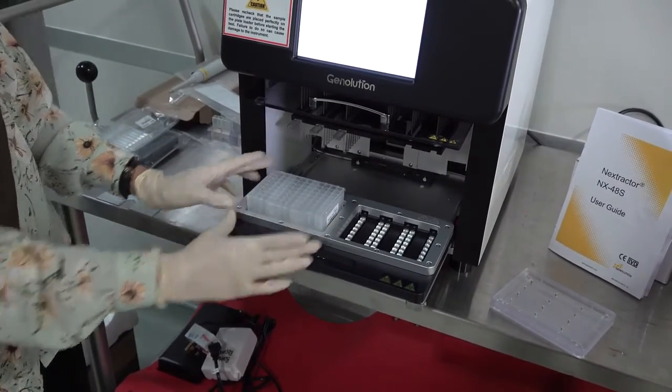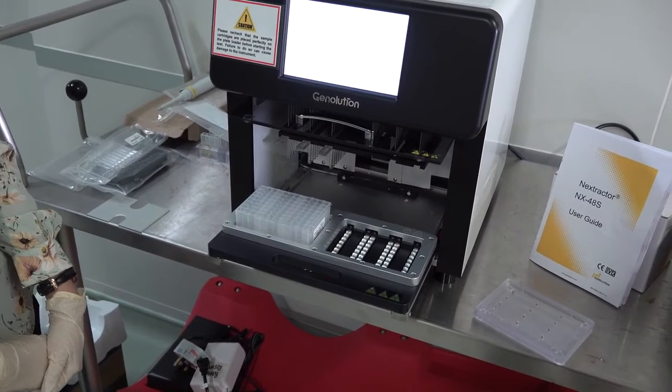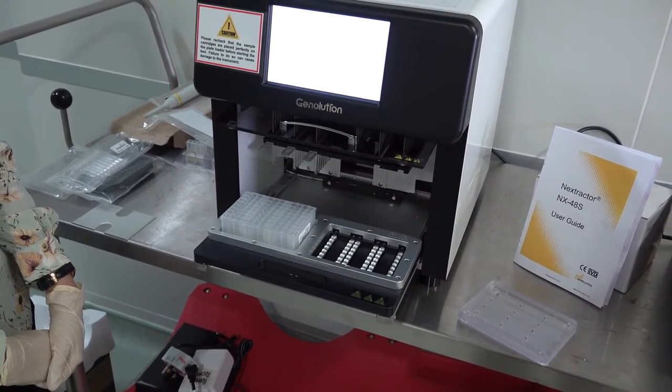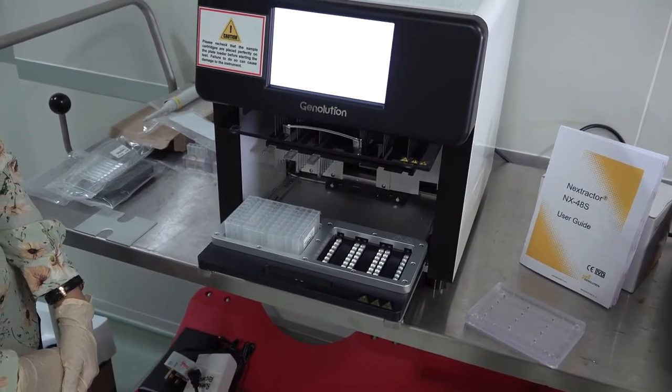As this is a demonstration video, we will not be conducting this tutorial outside the lab. The instrument will be basically operated inside the lab. But this is the basic idea of the setup.